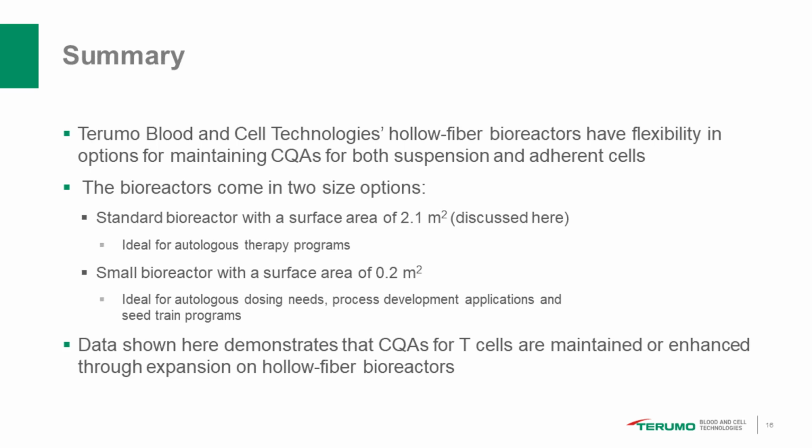Is the hollow fiber filter type fixed, or are other pore sizes available? Have any other cell types other than T cells been used in the system? We have many examples of different cell types that are being used on the platform. The system really is agnostic to what cells you want to grow in there.